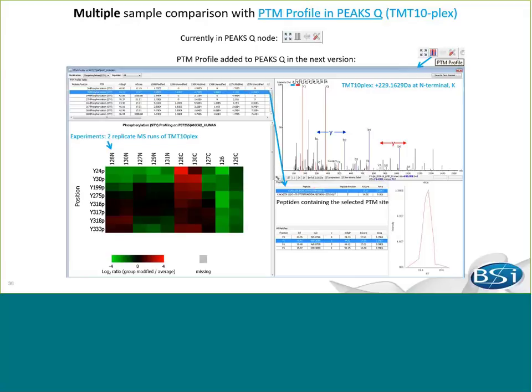For example, here, the first peptide is a fully digested peptide, whereas the second one contains a miscleavage. For each selected peptide, all features matched to it are displayed in the all matches table. Here, ions of different charges and from different mass spec runs are displayed separately. And you can see the MS1 peak of each feature in the extracted ion chromatogram figure next to it. In the export CSV file, more detailed information is provided in addition to what is shown in this PTM profile table.